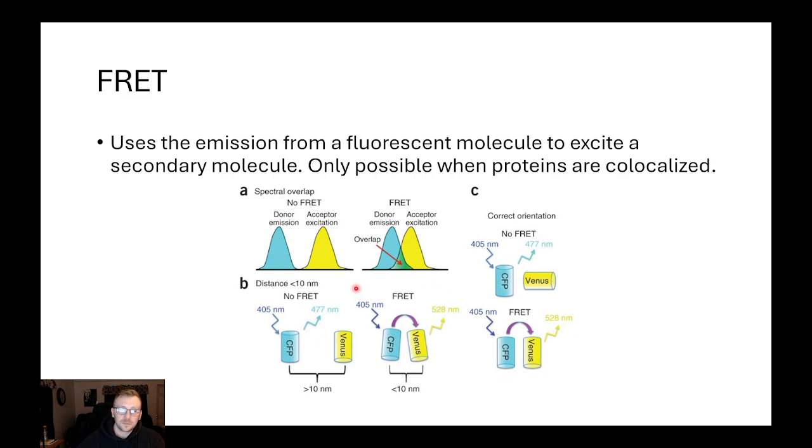And so we're going to hit our first protein with our 405 wavelength. And when we do that, all the proteins are getting exposed to 405. But because protein B excites at 477, we're not going to get this protein B to be fluorescent. We're only going to get 405 to be fluorescent. And so in the event that you have co-localization, you're going to utilize the Stokes shift and the emission spectra change from 405 to actually excite the acceptor, which is our 477 nanometer in Venus, right?